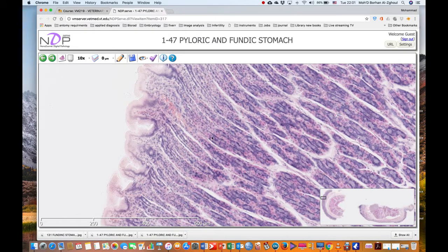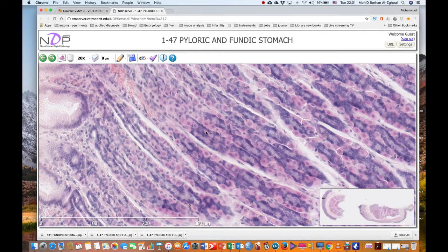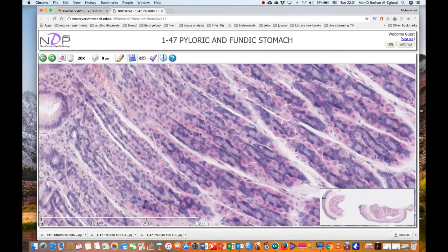And we start to see two different cell types. Okay, see the difference between this type of cell and this type of cell. Here we can see the cytoplasm, it's pink in color, whereas the cells here are more basophilic or bluish in color. These cells here are found almost in the periphery.